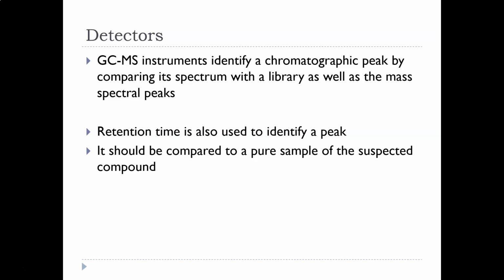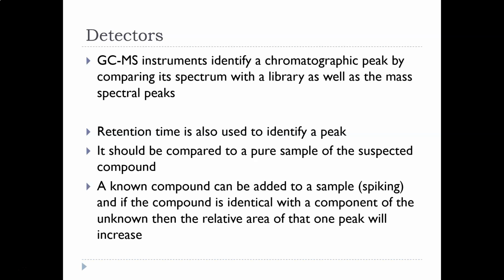This is a very common instrument and it's used a lot when we have samples that we don't know what's in them, truly unknown, like environmental samples or just unknown things, because mass spec is able to help you identify an unknown compound, where GC doesn't. It can tell you if the retention time is different than compounds that you know, then it's something different, but we don't know what it is, just that it's something other than the things that we do know.